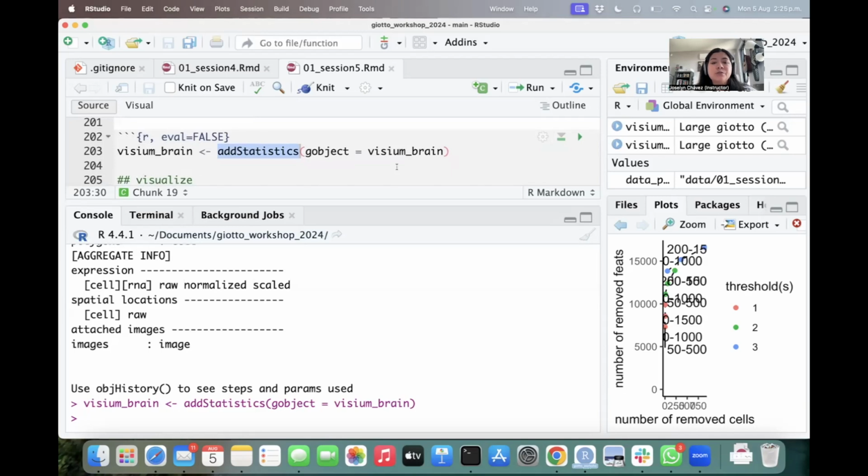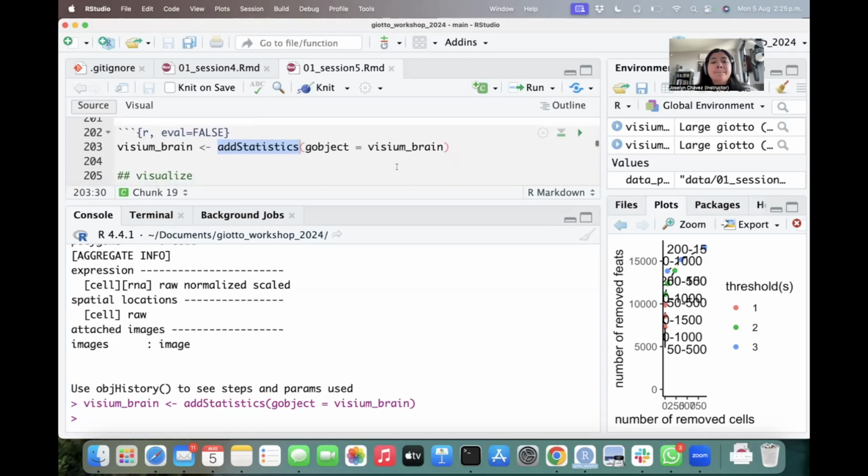will be a little bit different than if you take into account the raw number of features, because this time we removed all of those features that didn't accomplish the filtering thresholds.